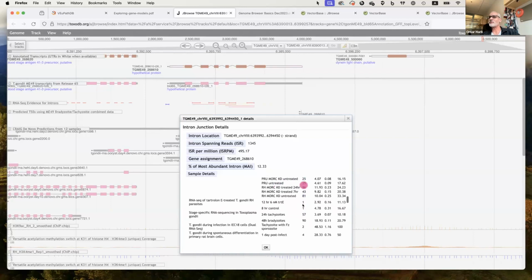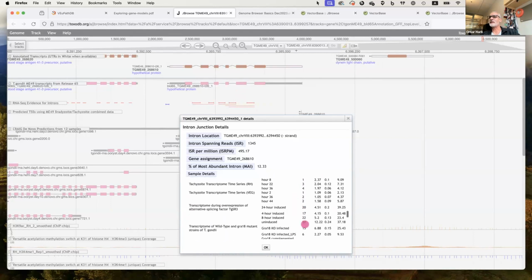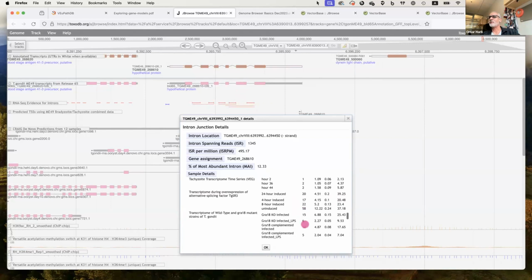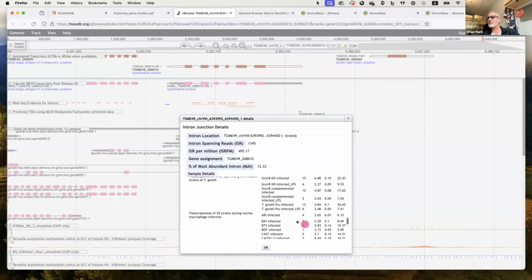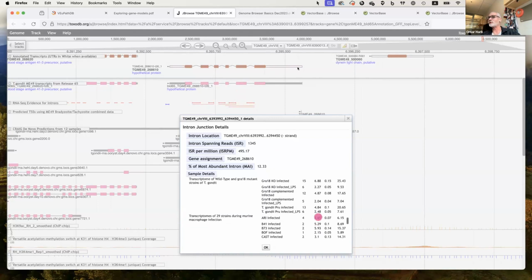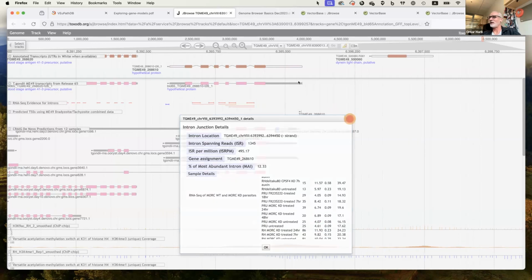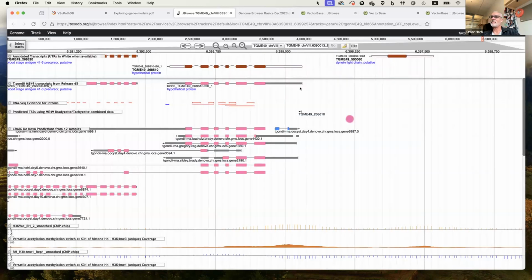But what's also important, and I'm going to pin this one as well, is to take a look at the other evidence. You can see here's the actual read data, and it is almost matching, where some of these reads extend out. So there are some species where this UTR goes out up to this transcription start site. So it's probably a reasonable transcription start site, but it doesn't mean that you may not have other versions of this.